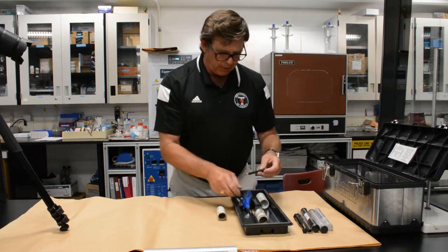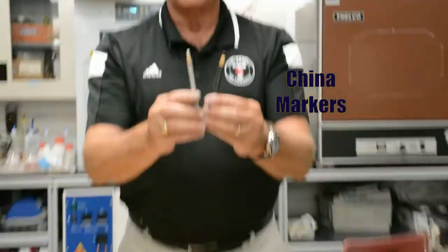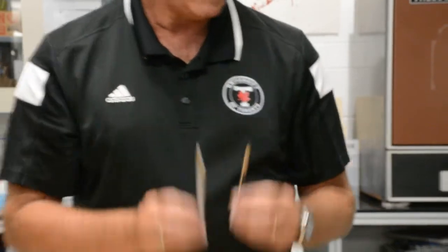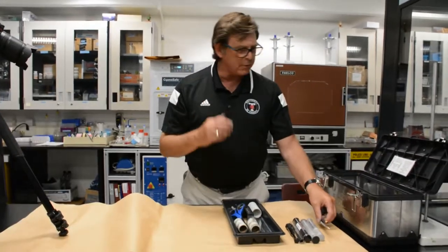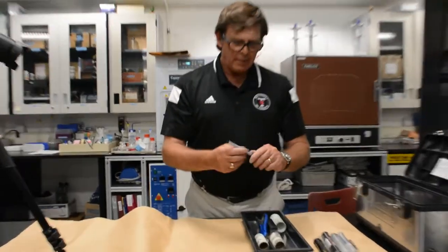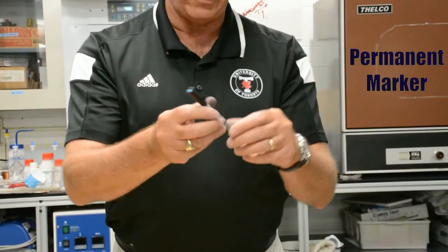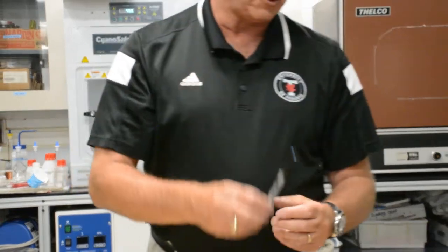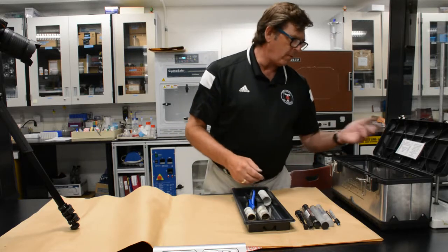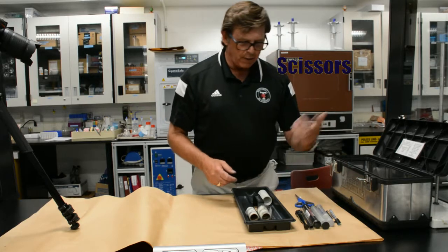Other components of the kit include a couple of color contrasting wax or china markers, and these are used for marking or labeling your fingerprints after they've been developed on the surface and prior to lifting. There should also be some type of permanent marker, either Stadler or one of the other companies, Sharpie or whatever, to highlight certain areas of the impression and to mark them on a permanent basis. A pair of scissors as well, and then we get into the brushes.